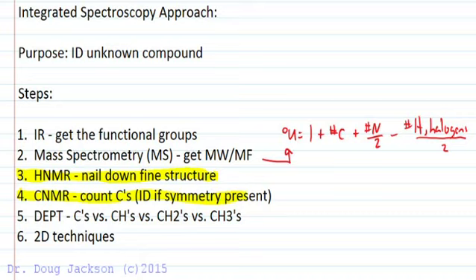I'm going to scroll through some notes on NMR analysis and spectral analysis that we've talked about before, but due to production limitation times, I'm going to be very brief in scrolling through these and then only really explain everything in terms of analyzing the spectra. So we're going to keep this as concise as possible.